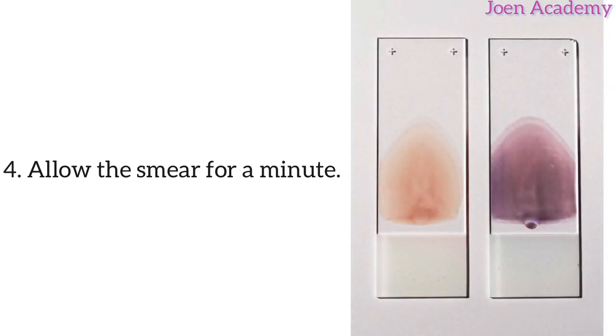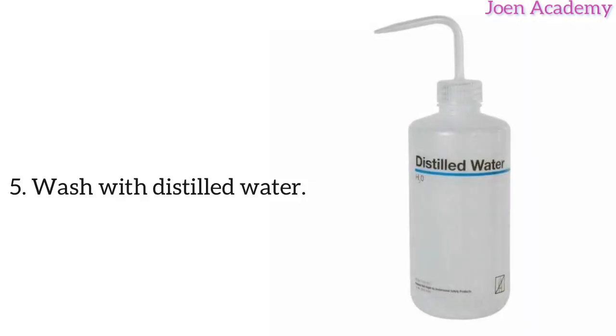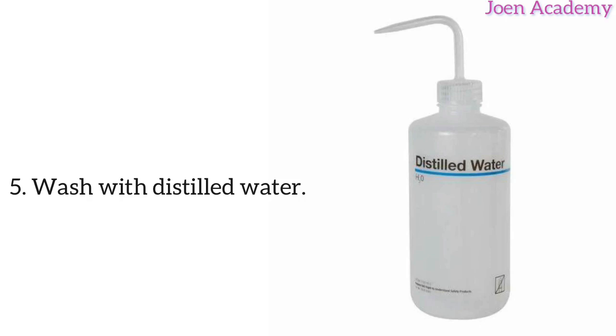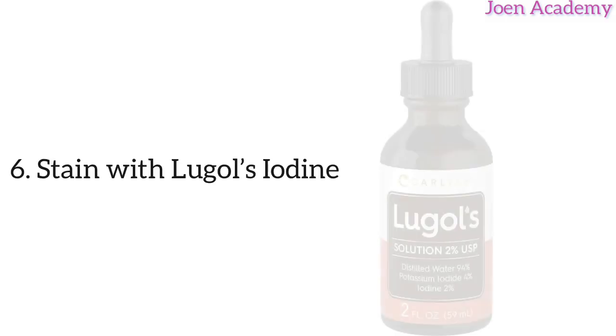Allow it for a minute. After the smear has been allowed for a minute, wash it off with distilled water. After washing it off with distilled water, then stain it with Lugol's iodine.